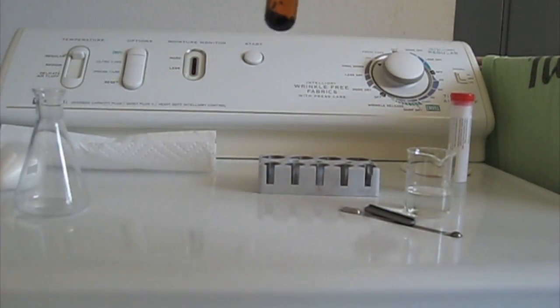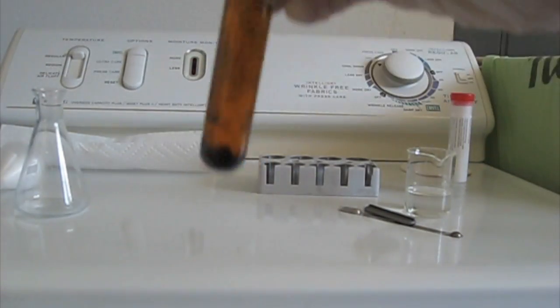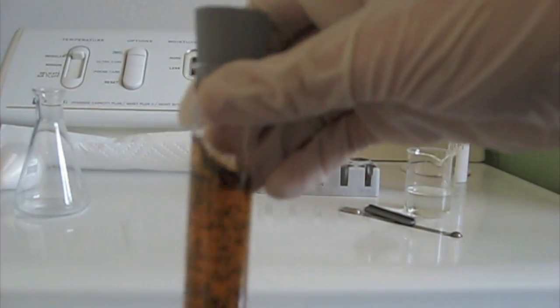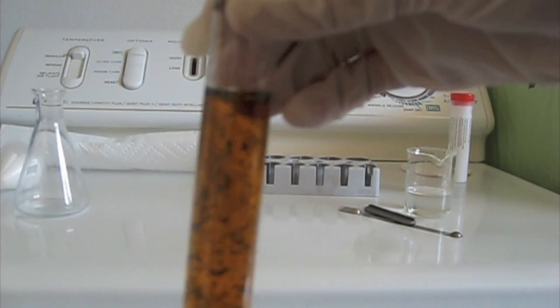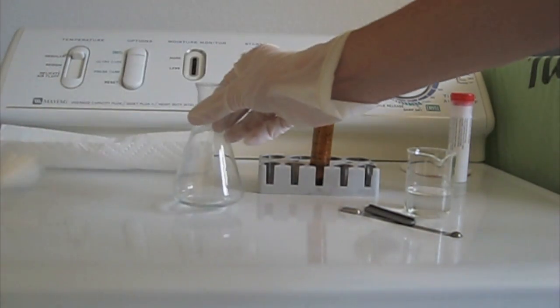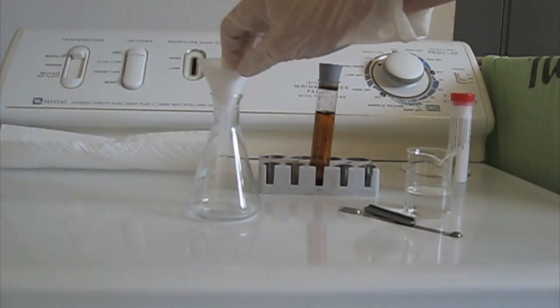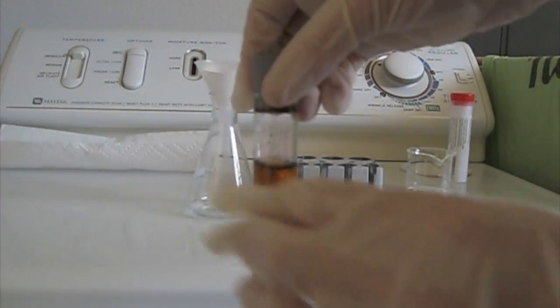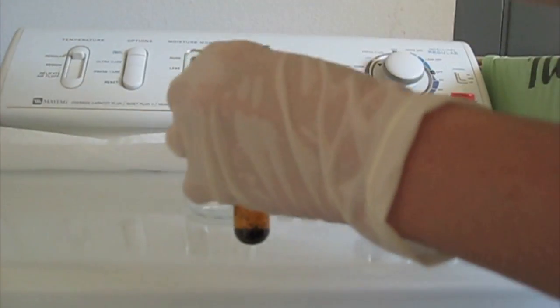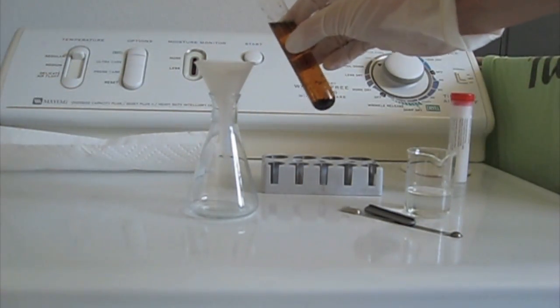So I've brought everything inside, and as you can see, there's a bit of iodine collecting at the bottom. The iodine is the black material you see, the lump on the bottom. Now I'm going to filter off the iodine from the solution. So I'm going to take my funnel and filter paper, and I'm going to filter it into this Erlenmeyer flask. Just a word of warning, again, iodine stains everything, so be careful not to spill it on anything.